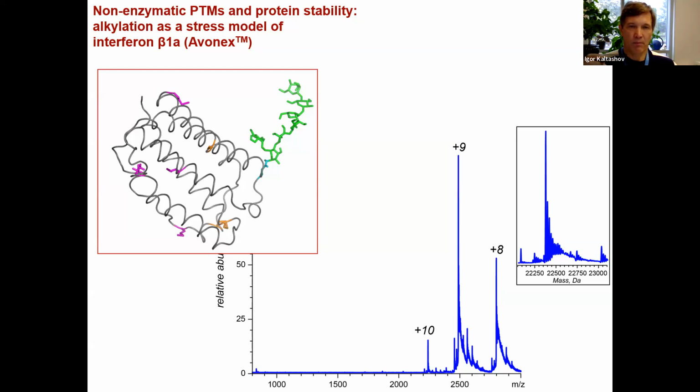This is a fairly small protein, and an interesting thing about it is that it has an odd number of cysteine residues. There are 3 of them. 2 of them form this disulfide bridge here, but 1 of them is unpaired. And it had been viewed as both a source of trouble and an opportunity.